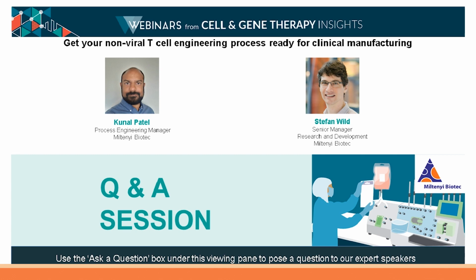Brilliant. And if processing more than one donor at the same time, can the EP unit be moved across Clinimacs Prodigy to reduce the processing time? If you'd like to have a stab at that one. So typically, these systems are installed really as a system, and as the software runs both instruments, it's not possible to exchange or remove the electroporator during one process. So you have to keep the system together.